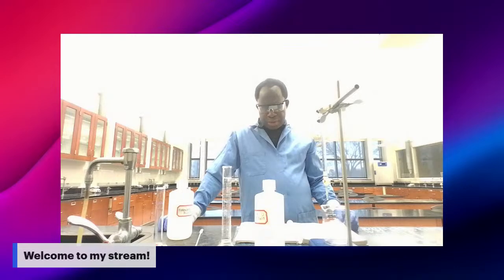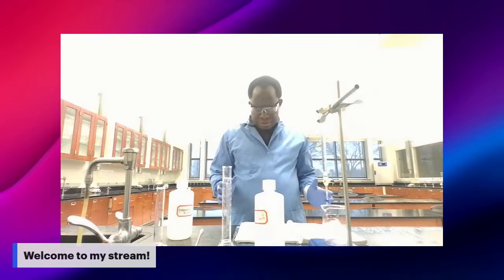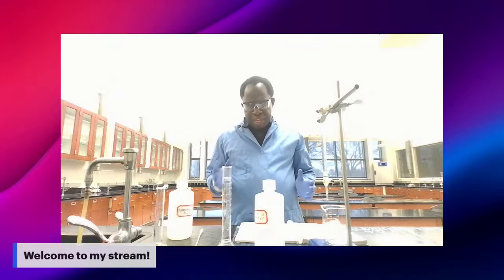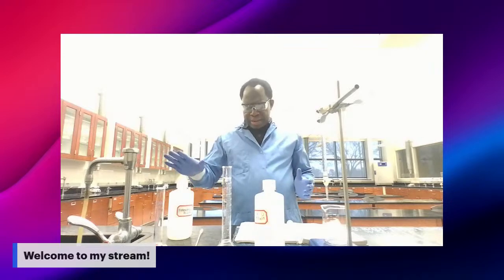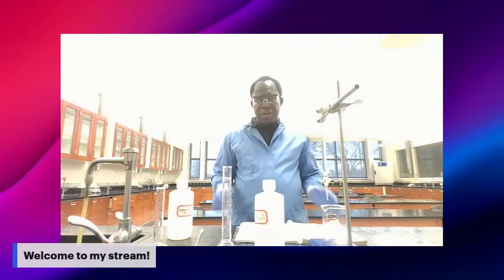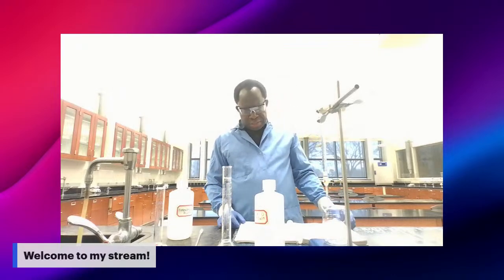After you perform your titration, the next thing you will do is draw a titration curve, with pH on the y-axis versus volume of NaOH on the x-axis, for each titration you perform in this lab.